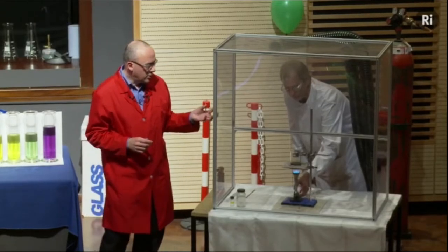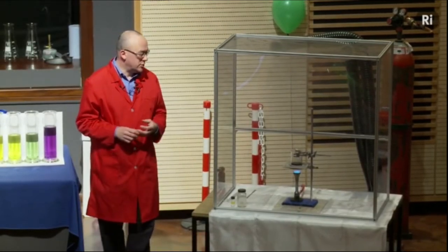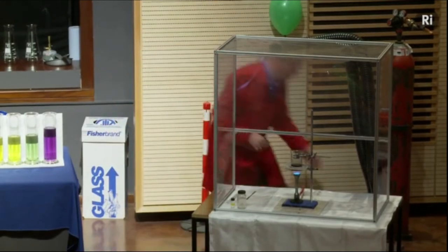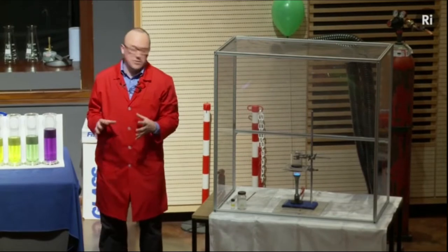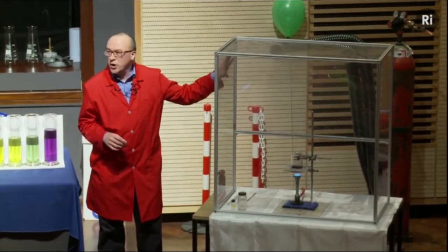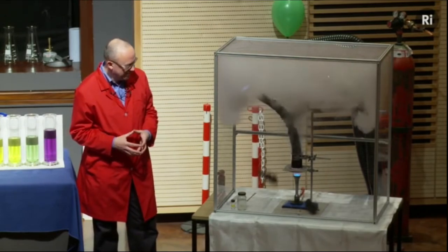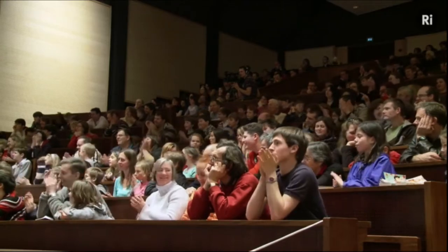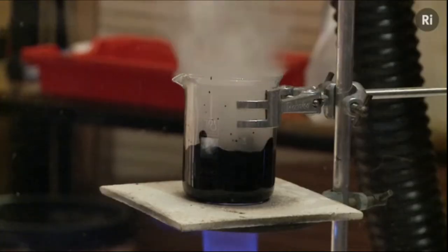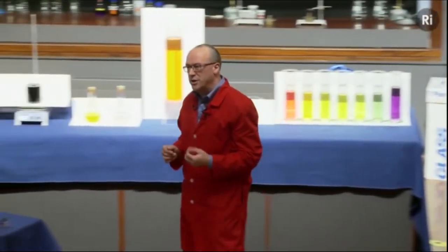And when it's hot enough, it will undergo a reaction in which this liquid will turn into a solid. This makes quite a bit of smoke, so we've got this special hood that will suck away the smoke from the reaction. Okay, here it goes. Okay, so that's a chemical reaction that involves a change of state.